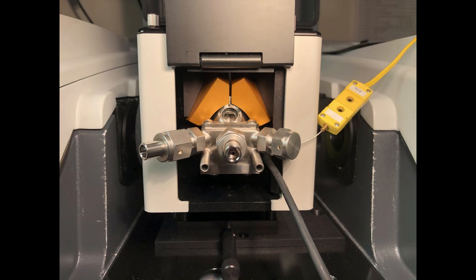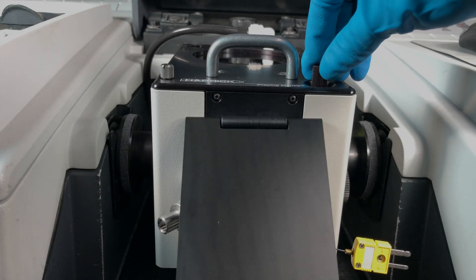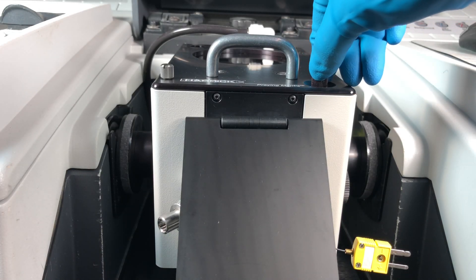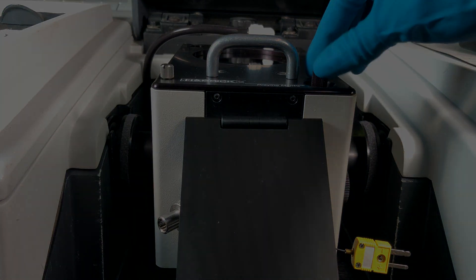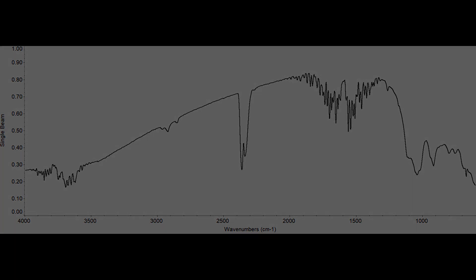Set the temperature and pressure to the desired operating conditions. For IR operations, set the spectrometer to measure the energy on the detector. For UV-Vis spectrometers with a micro switch, with the spectrometer in percent T mode, hold the micro switch to activate the detector. Adjust the height of the sample to maximize the signal on the detector. Collect the background spectrum, then restore the reference material to ambient conditions.